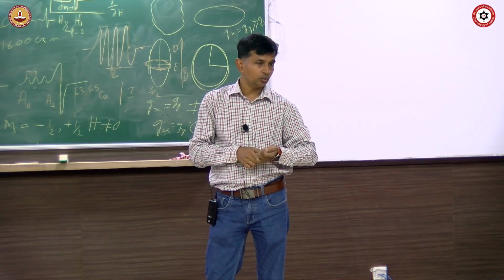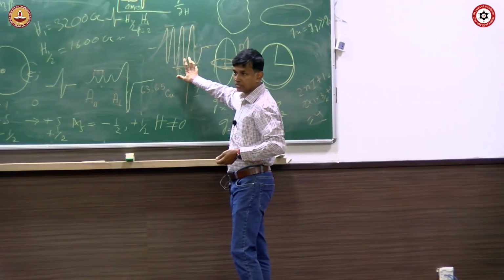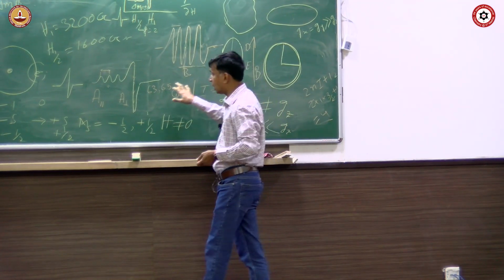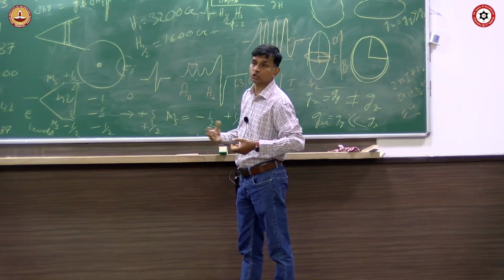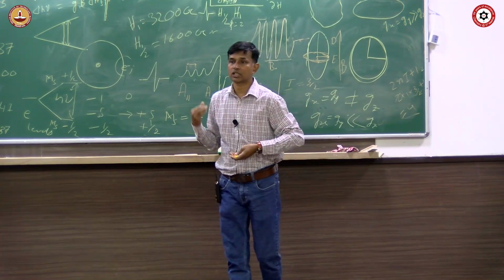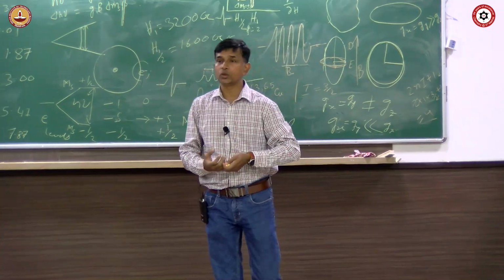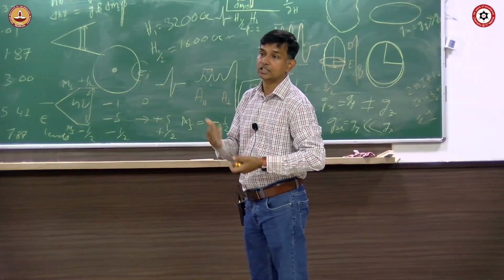So now a few minutes ago EPR spectroscopy was just some numbers and some signal for you, but now it is speaking about the chemical environment and the distortion. It gives you a tool where you can look into your system and you can predict about it.